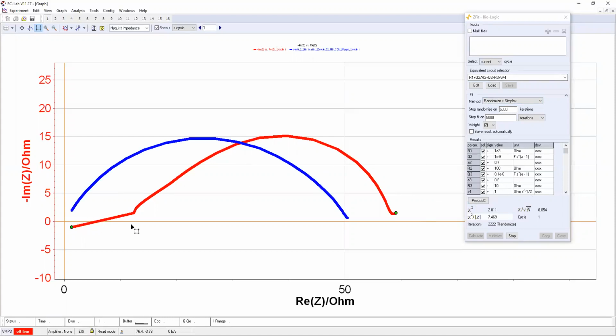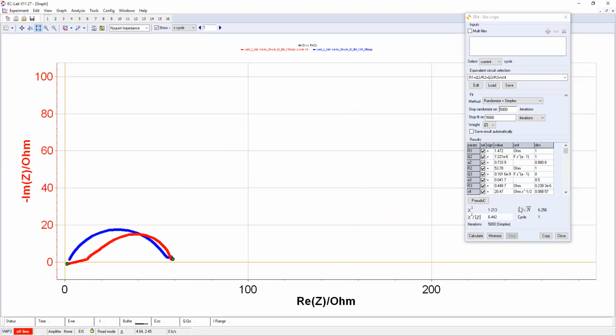So we need to set up, like, the first value should start from here, because this is imaginary. So I'm now going to show you how we can get the information after the fitting. Let's say this is the fit, because it will take time if I want to adjust it.